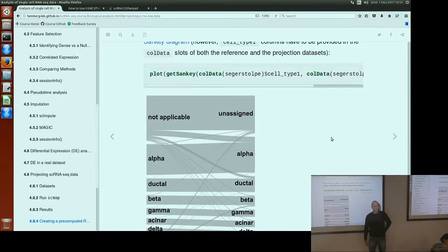The question is, can you be sure whether the differences are technical or biological between two samples? I think you can never. Here it's obviously you will have both, because the experiments come from different labs, and probably they did it under different conditions, right? So you have both biological and technical differences. But we are not looking at the differences in this case. We are trying to find similarities, right?